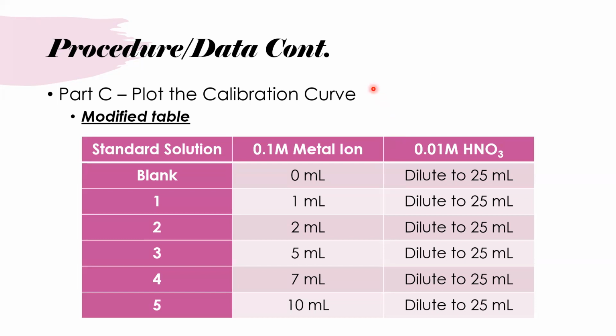And then using the volume. So we changed the volumes, we made them smaller, and then using the volumes of the stock solution sample, as well as the molarity, along with the volume you diluted to, you can calculate the molar concentrations for these diluted samples. I think number 2 part C in your pre-lab assignment basically shows you how to do that.